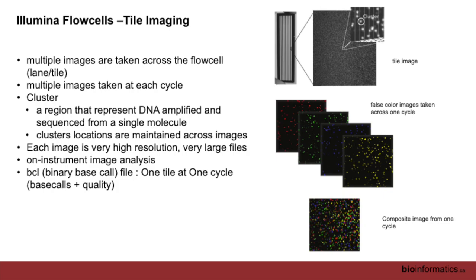So a cluster again is a region that represents a single DNA molecule that's been amplified, and it's important that these cluster locations are maintained across the images as we look across them. What we see here is a false color image, showing that with the introduction of the four bases, we take an image, and the different colors represent different bases put together into a composite image.